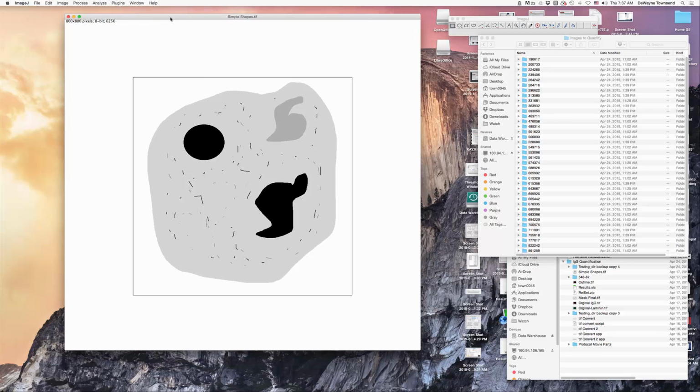So as we approach this, we want to quantify these areas, and we want to quantify the entire area, but we don't want to include these individual little specks. The key behind this is the ability to threshold this image. Thresholding is pretty straightforward.